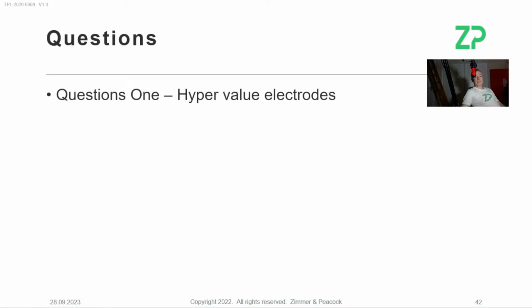So today I've talked about hypervalue electrodes. I've talked about our working electrode being either carbon, platinum, or gold. If you've got a choice, please use carbon. I've talked about the reference being silver chloride. I've talked about the counter being silver chloride, and that it's not by accident that they are. The gross dimensions: the width of our screen-printed electrodes is often 7 millimeters, the length is 25 millimeters, and the thickness of the material is about 625 microns.